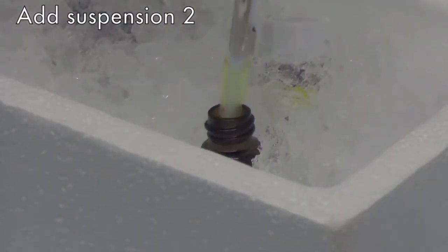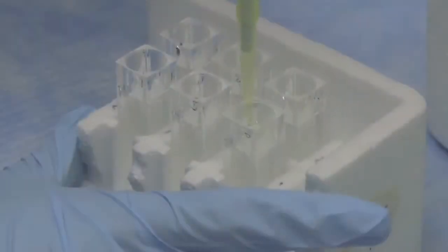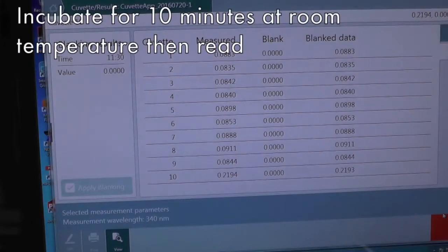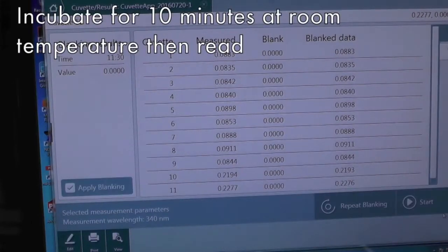Add the proper volume of suspension 2 directly into the cuvette and mix by pipetting up and down. Incubate for 10 minutes at room temperature, then read the absorbance.